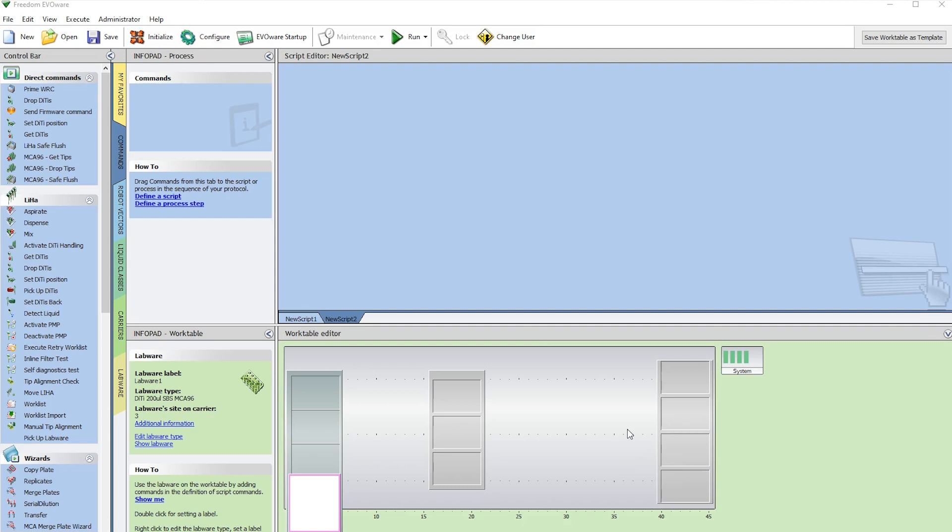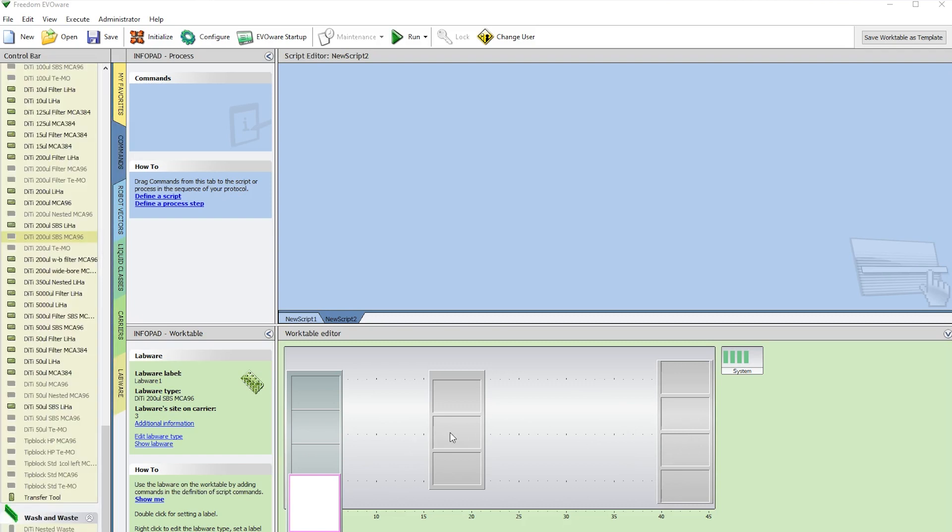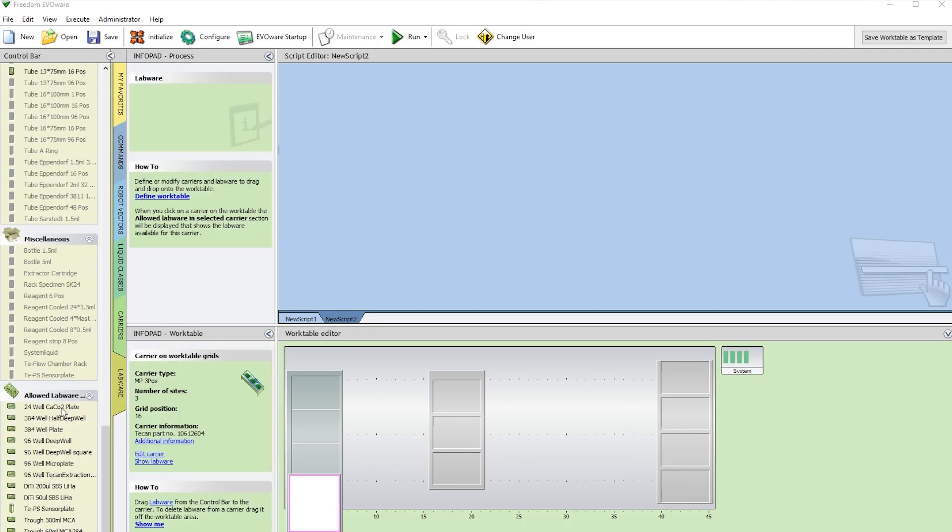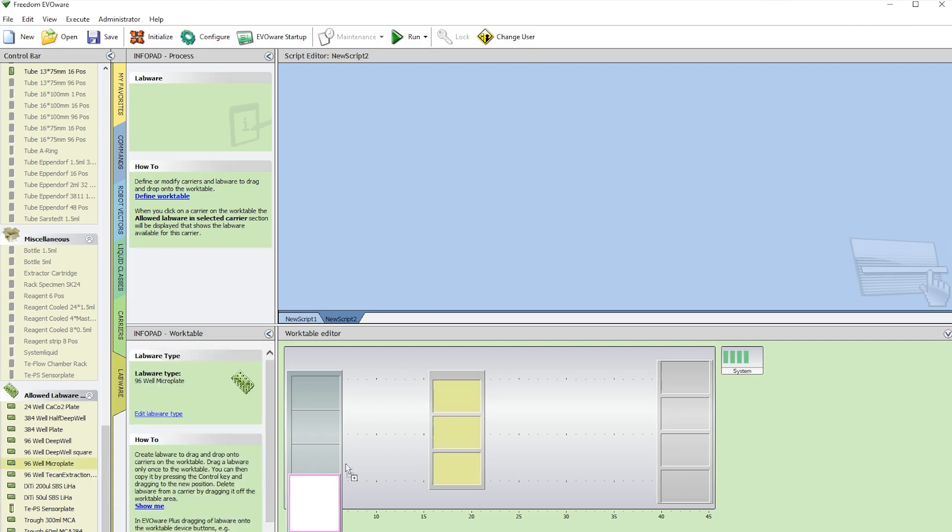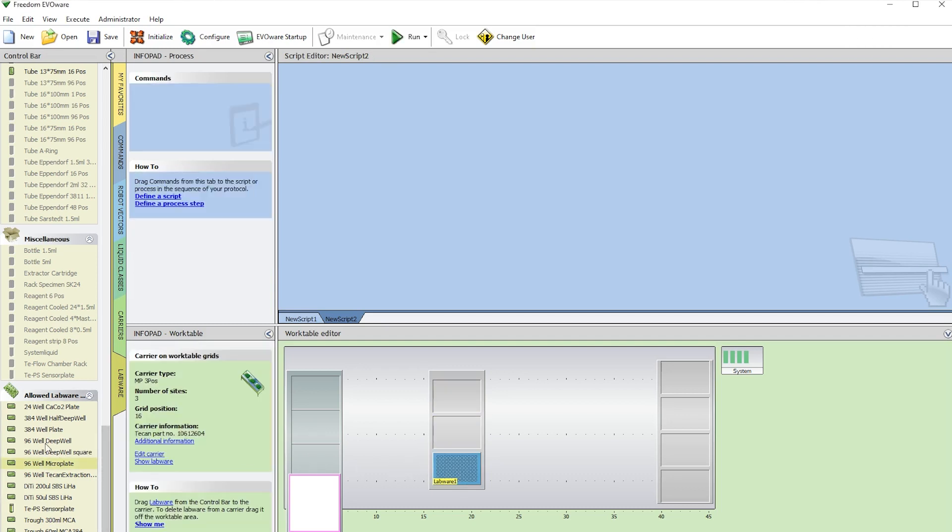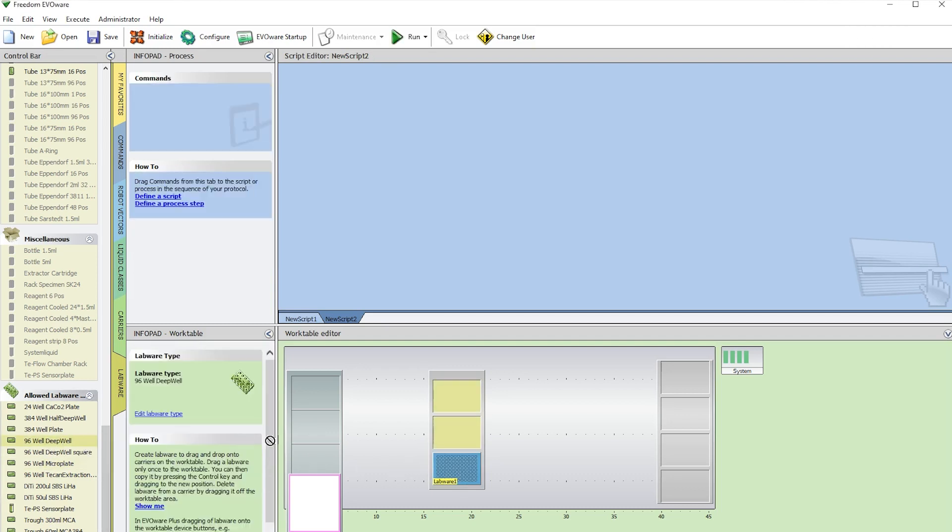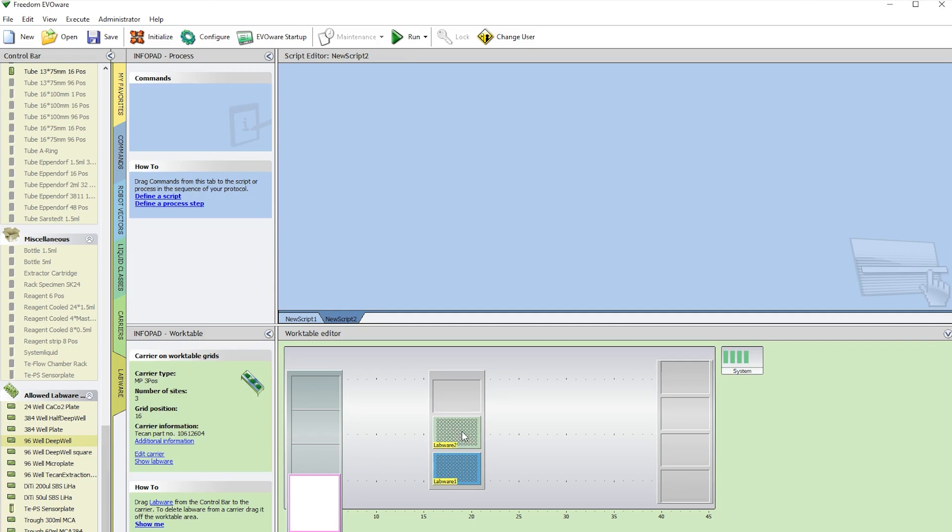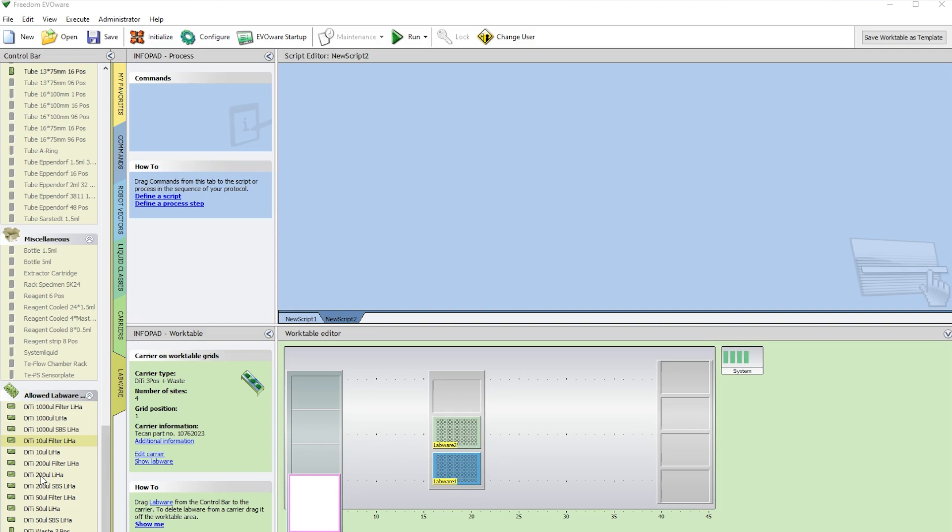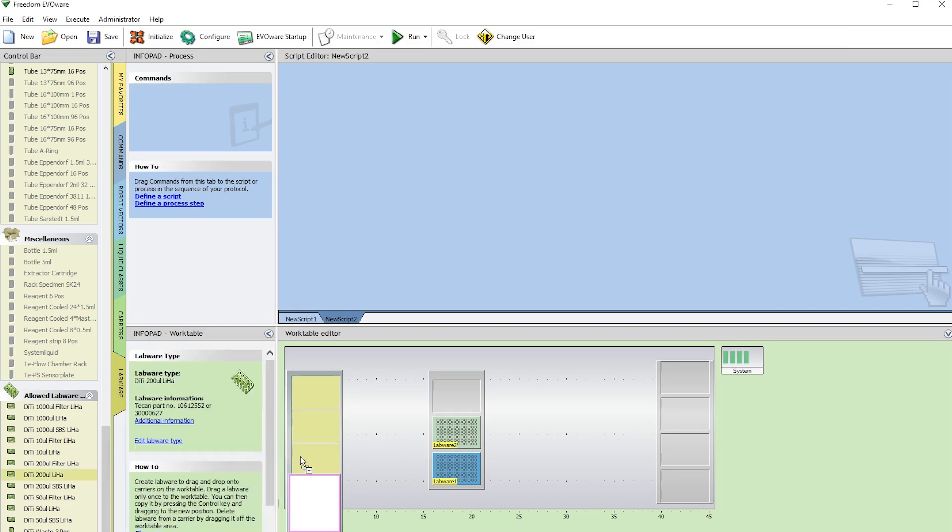So now we're going to build the labware on the work table editor. If you select the positions here, it shows you allowed labware. We're going to use the 96 microplate and 96 deep well for the trough. And now we're going to go to this carrier and select the DD 200 microliter tips. Click and drag the position.